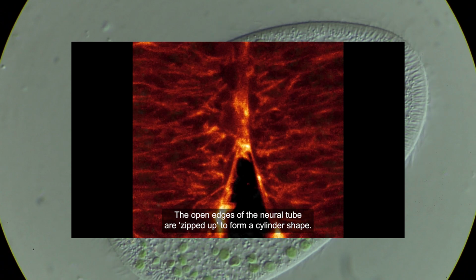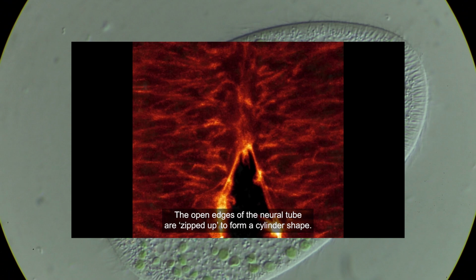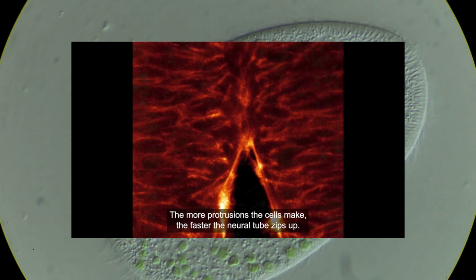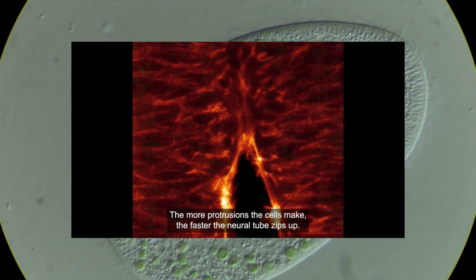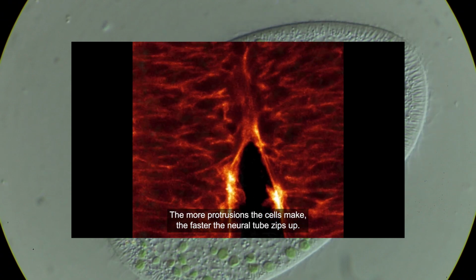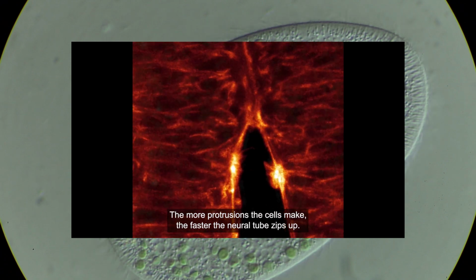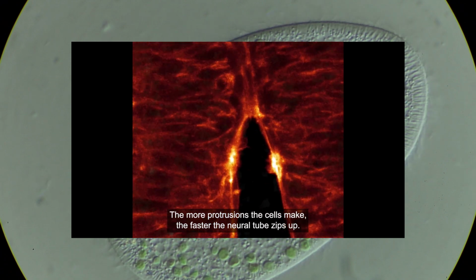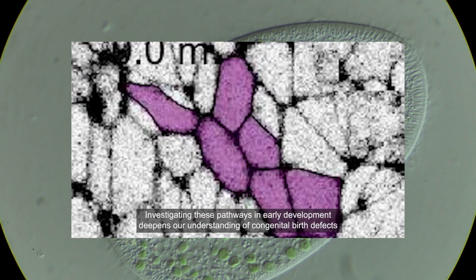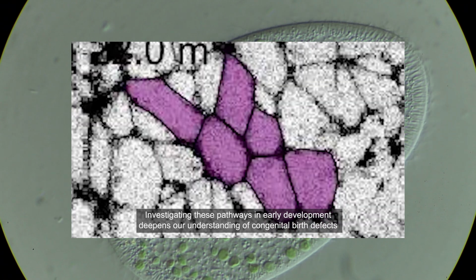This is particularly true if whatever fluorophore you're using requires a relatively short wavelength, basically UV light, and as you would be aware, UV light, given what it does to the human body and skin cancer, has an equally if not greater negative effect at the scale of a cell, where there is no protection from layers of dead skin cells, let alone everything else that the human body can do in defense of, well, for the most part, sunburn.